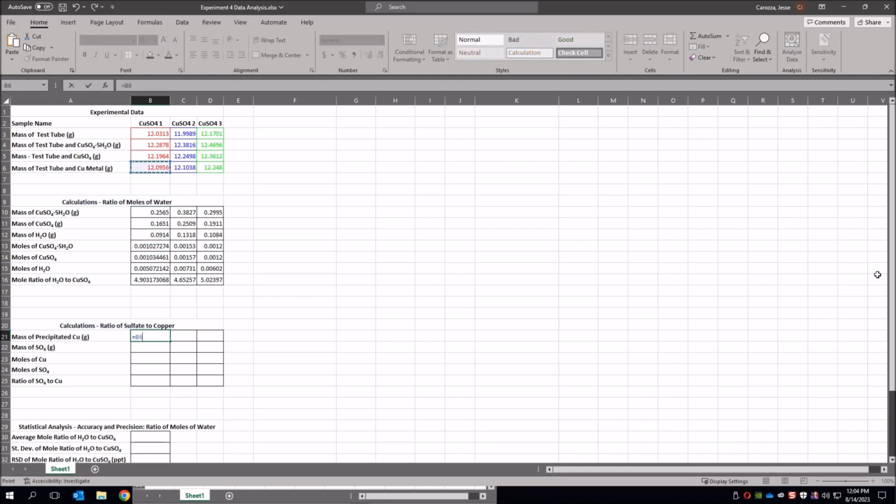So once again, the mass of our copper, get rid of the glass. Now mass of sulfate. Sulfate is something that we did not collect. You can't collect sulfate. It doesn't come in a bottle. I wish it did. It would make so many things so much easier in chemistry, but it's an ion. Instead, we exchanged it with the magnesium.